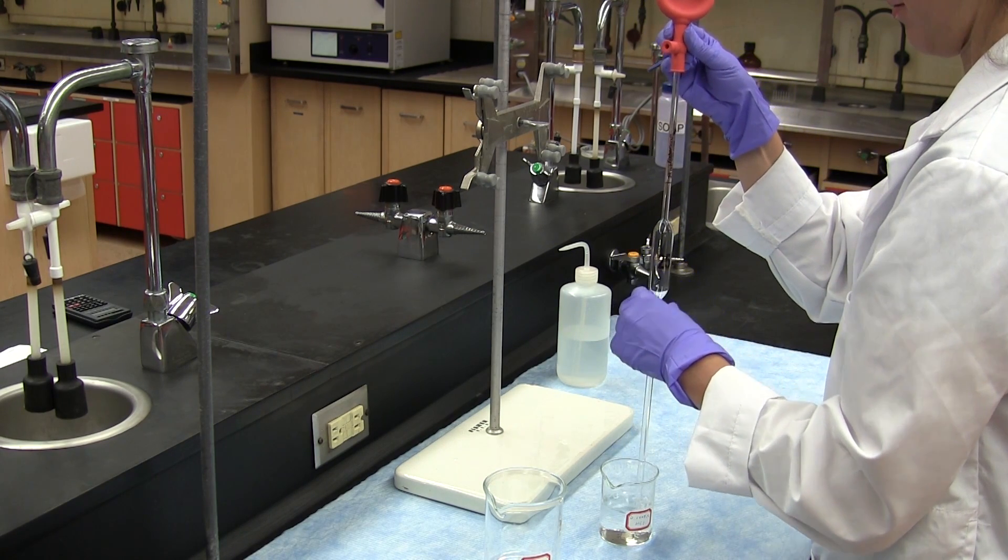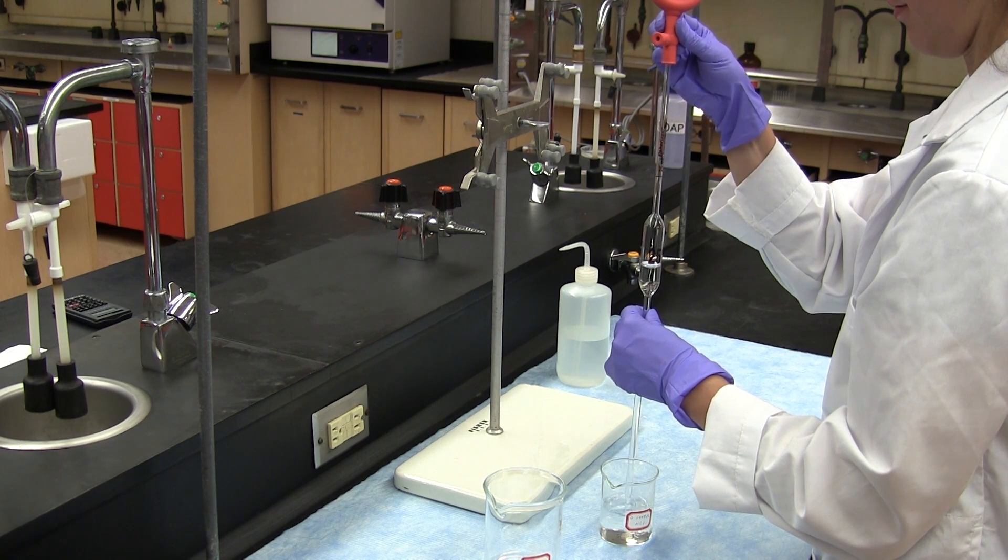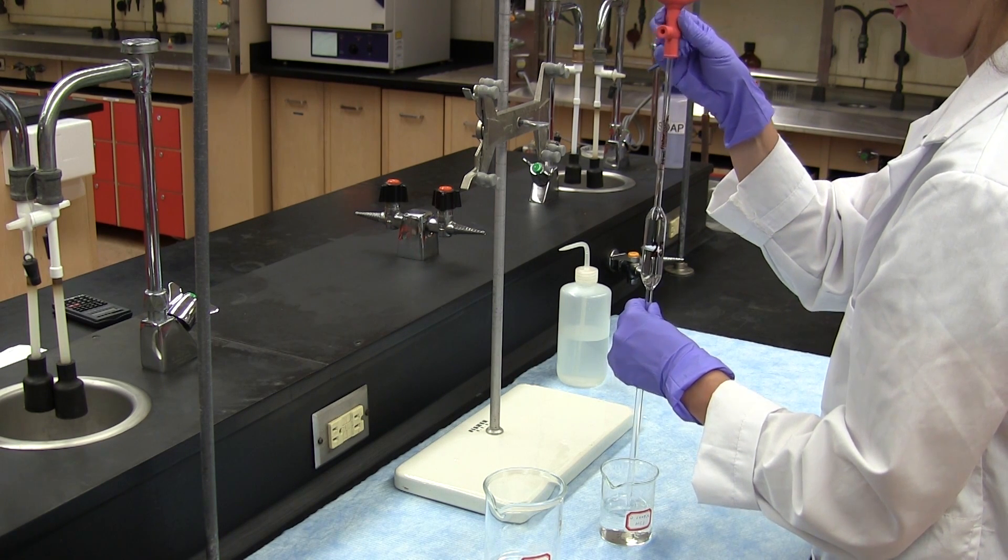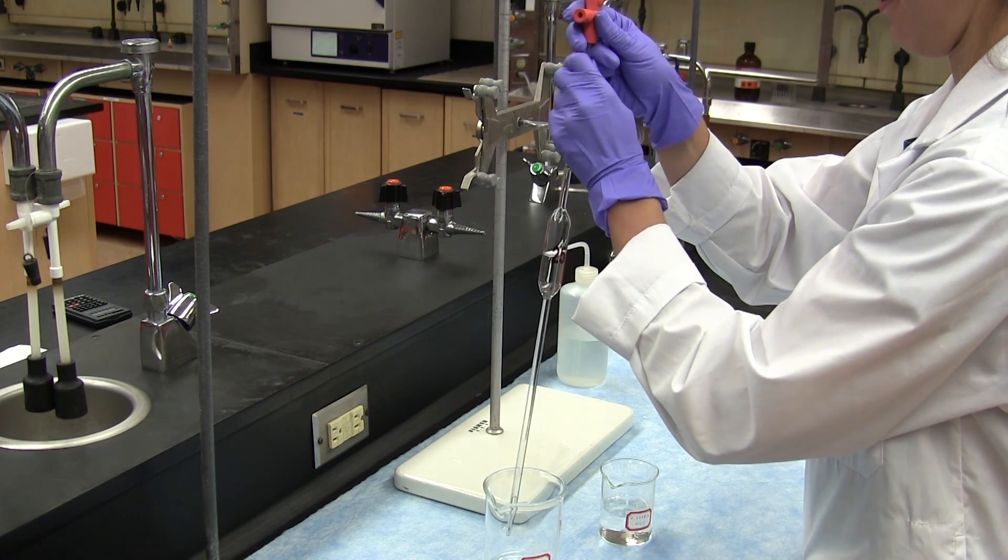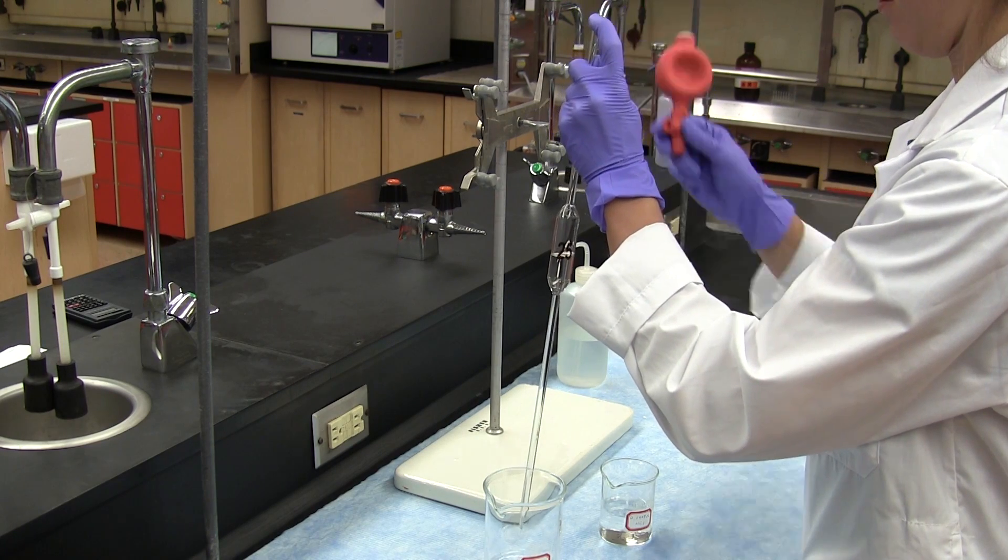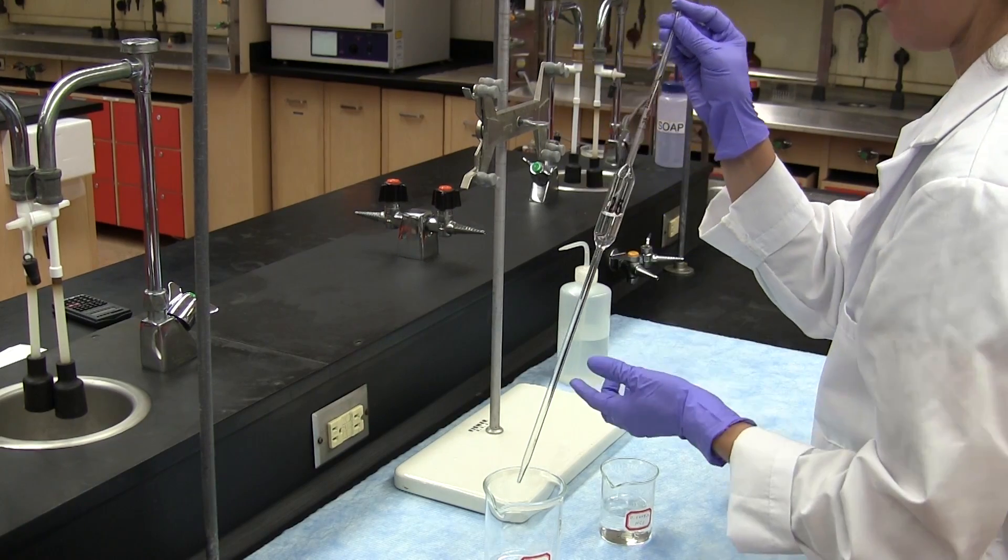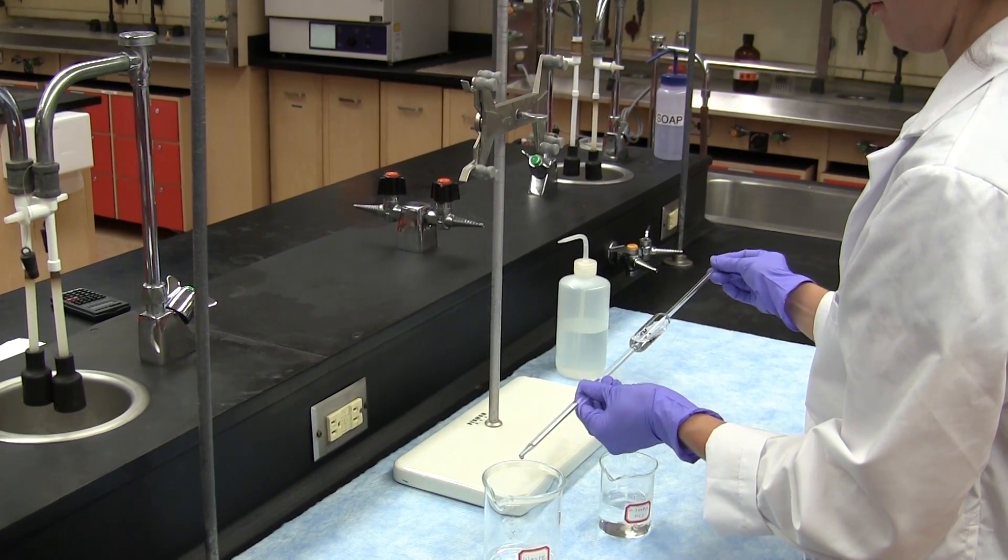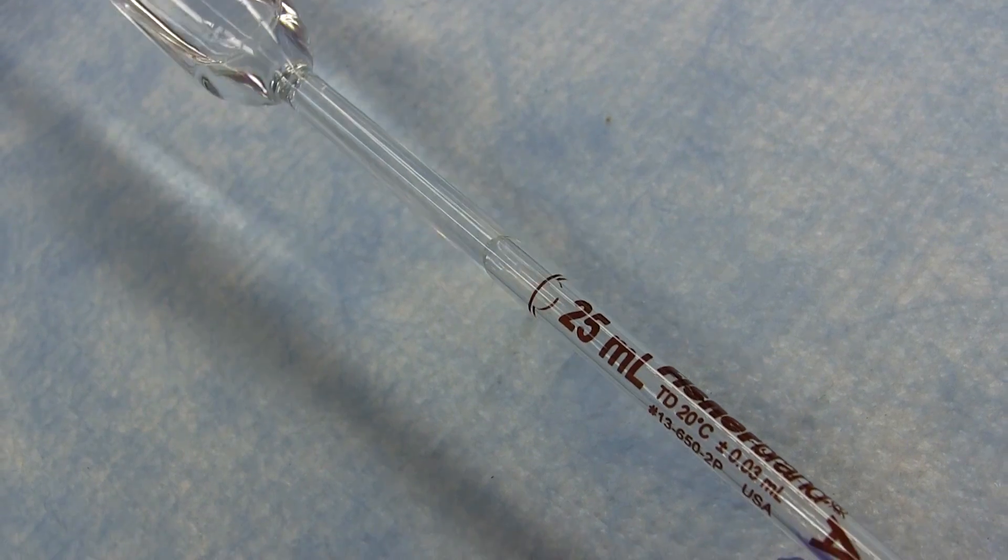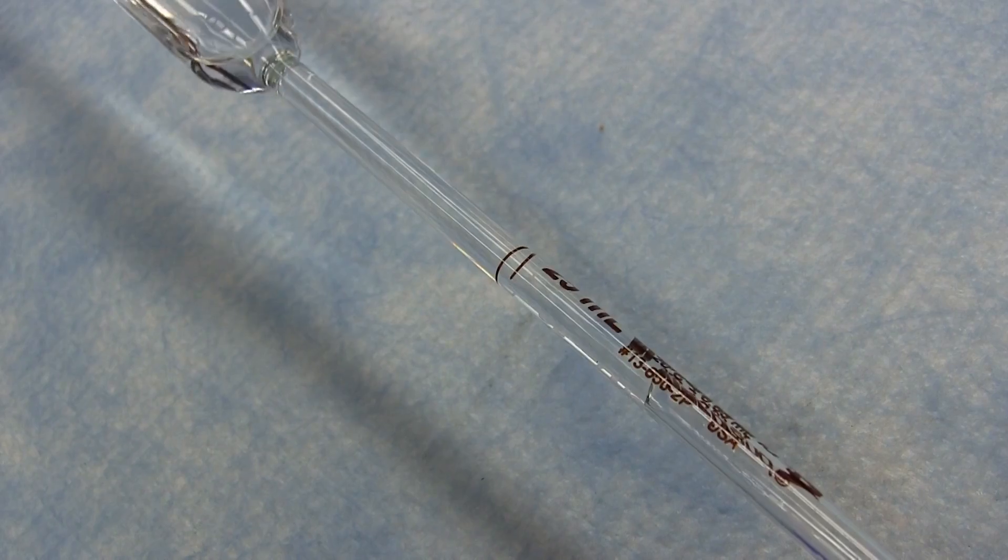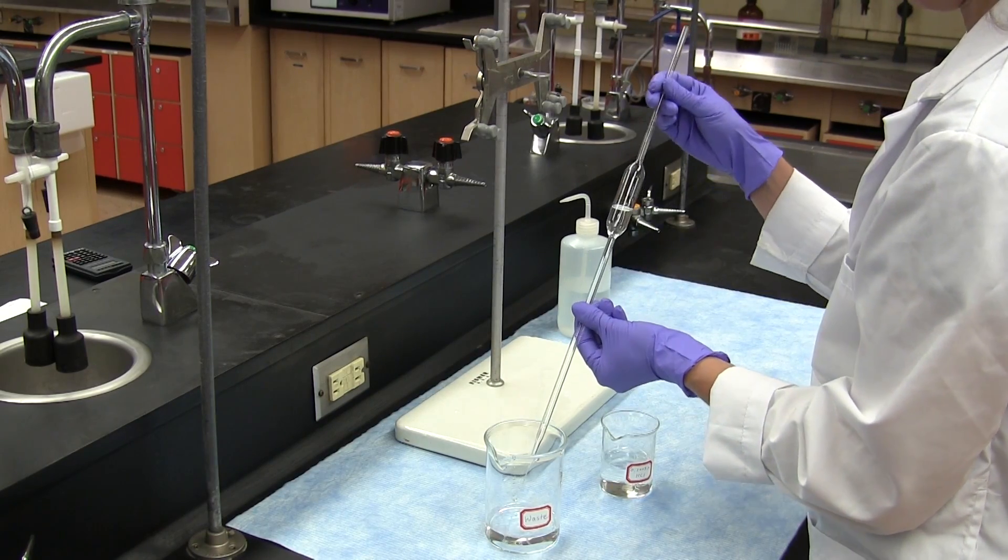The pipette is approximately half filled with the solution. The pipette filler is removed and an index finger placed on the top of the pipette. The pipette is then tilted and rotated to allow the solution to coat the inside surface to about two to three centimeters above the calibration mark and then discard the solution into a waste beaker.